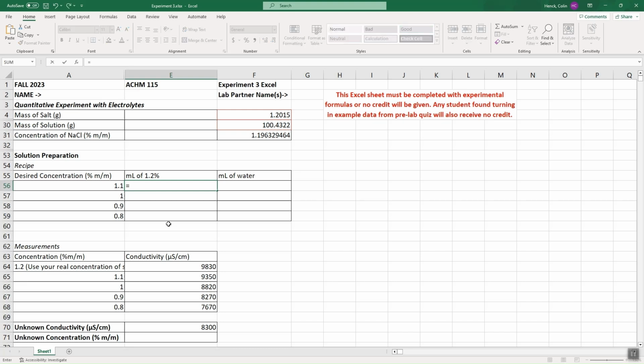So this is C1V1 equals C2V2. Specifically, it's C2 times V2, which is 20 milliliters, because we're trying to make 20 milliliters of solution, as I discussed before, divided by C1. So C2V2 over C1 gives me V1, how much of this that I want to use. It was 18.4 because we rounded before, and you can only really measure to one decimal place with a graduated cylinder. Now, how much water do you have to add?